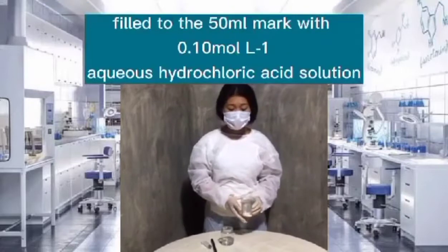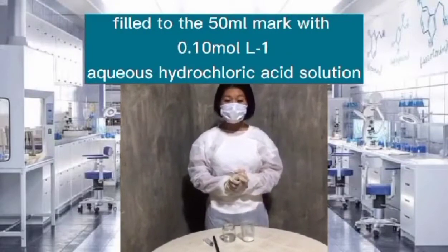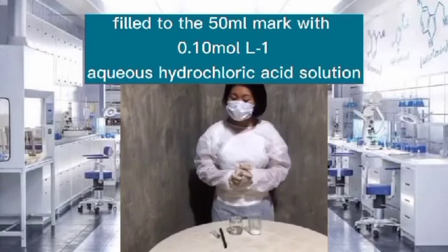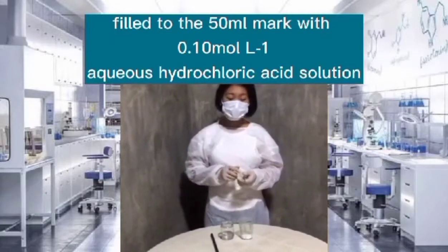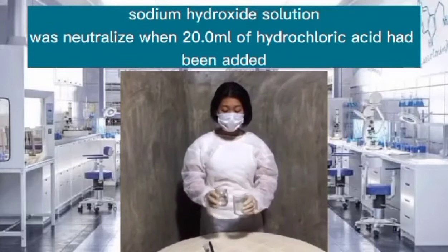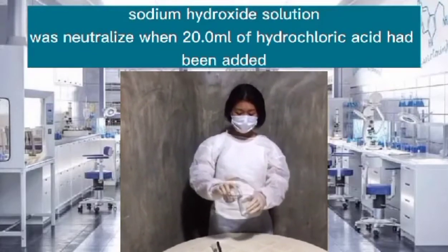The burette was filled to the 50 ml mark with 0.10 mol L^-1 aqueous hydrochloric acid solution, but we don't have a burette, so we'll be using a 10 ml syringe as an alternative. The sodium hydroxide solution was neutralized when 20.0 ml of hydrochloric acid had been added.